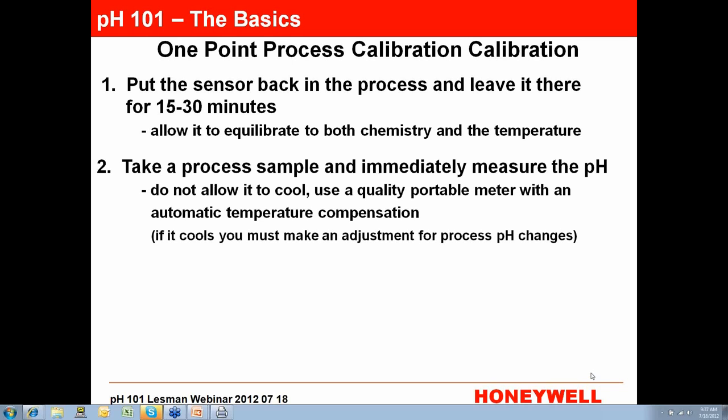Then take a sample of your process. If the process fluid is hot, use a good-sized container so it maintains its thermal integrity and doesn't cool down. Use a portable pH sensor that has automatic temperature compensation, and then measure the sample with it.